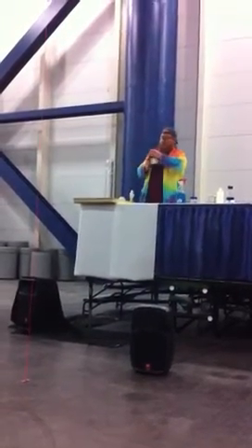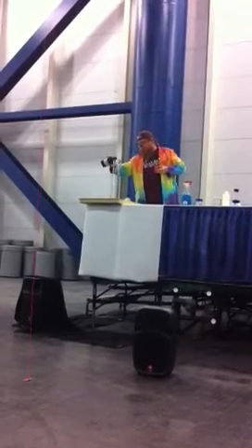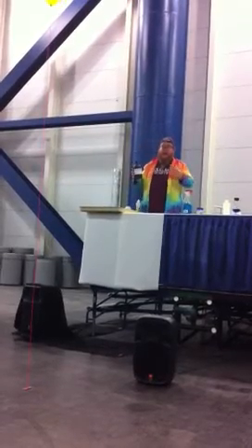Put in our graduated cylinder here. Now the first thing I'm going to put in is some hydrogen peroxide. Now you guys probably have some hydrogen peroxide in your medicine cabinet at home. So I want you to think about why you have hydrogen peroxide in your medicine cabinet.